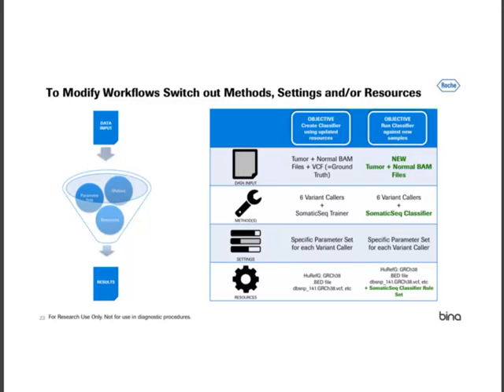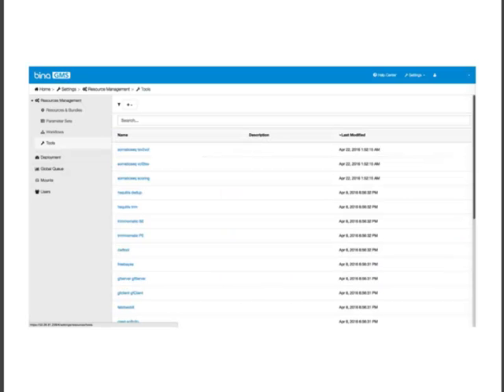The classifier that was created during the first workflow is called a classifier rule set or a somatic model, and will be saved as part of the resource bundle. So I'm also switching out the resource bundle here. That kind of flexibility in the genomic management solution allows you to do a lot more. Now let's see what the GMS interface looks like.